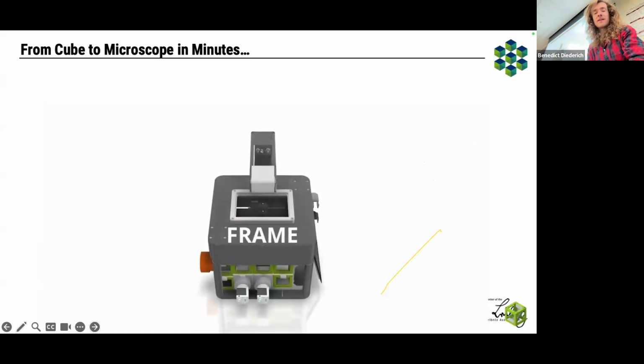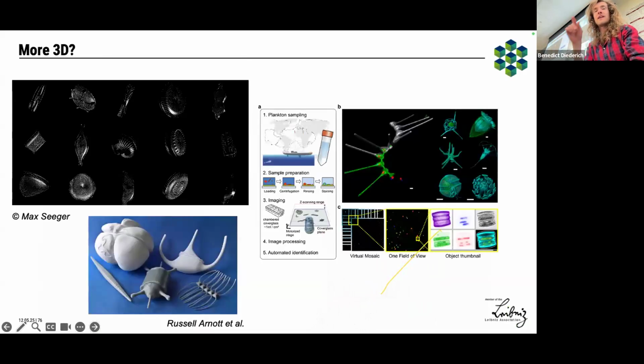Right, that's one thing. But other things that I have here on the table is light sheet microscopy. And I don't know, who of you have heard of light sheet microscopy so far? Oh yeah, many. It's mostly the optics fraction on the left-hand side here. Okay, I see. So I think it's the same problem pretty much in all optics. Like if you take, I see probably everybody sharp and in focus, no matter whether it's first row, second or third.